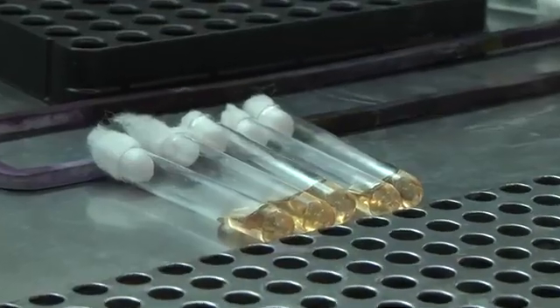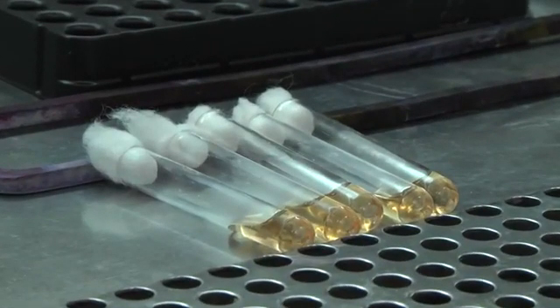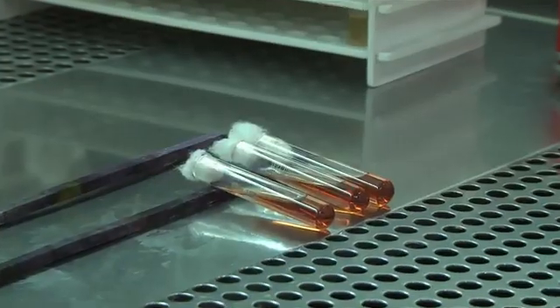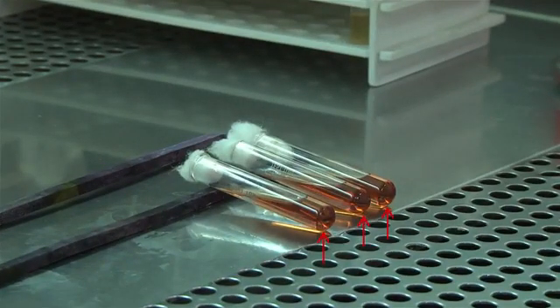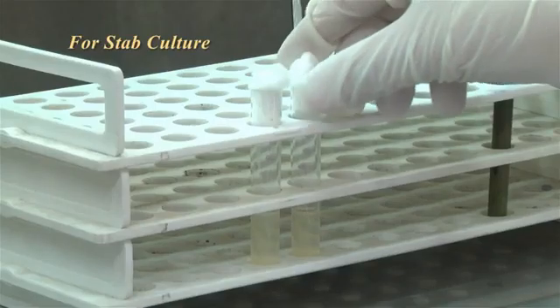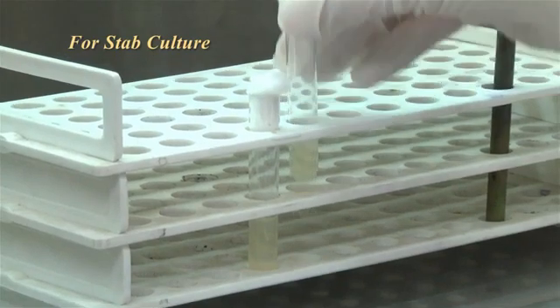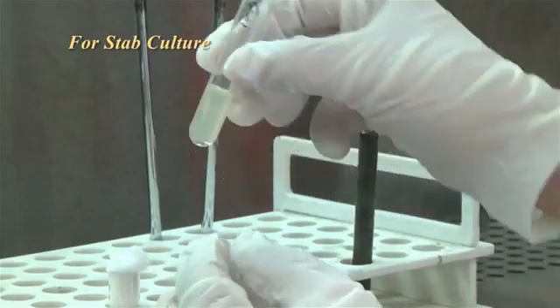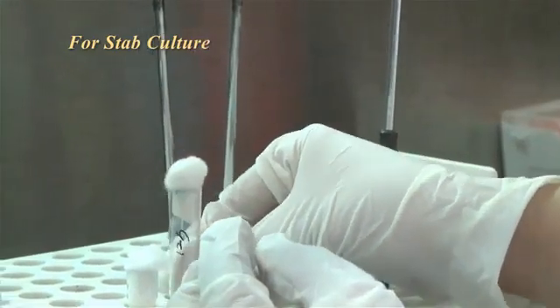For making a slant or a slope, the tubes have to be laid at an angle which allows the slant to be formed. The medium is poured such that there is a thick butt at the bottom. This shape provides a large surface area for inoculation. If the medium is used for a stab culture, the test tube should be half filled with the medium and allowed to set in an upright position.